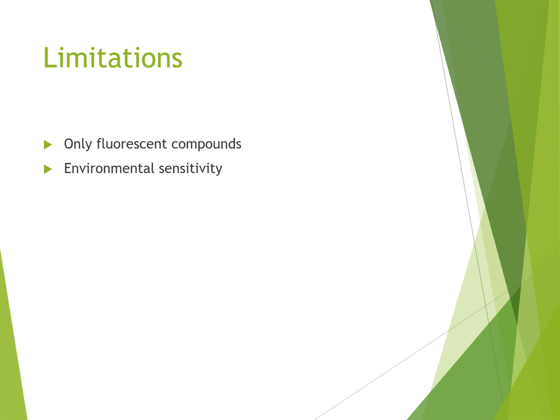If we see the limitations, they include quenching and applicability only to fluorescent compounds. So only fluorescent compounds can be detected, and it is also relevant to environmental sensitivity. That is its limitation, that only fluorescent compounds can be studied in very low concentration.